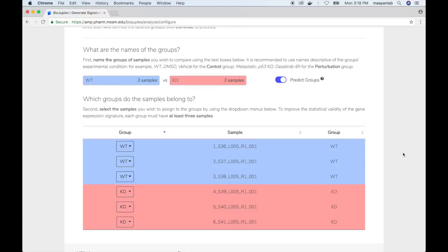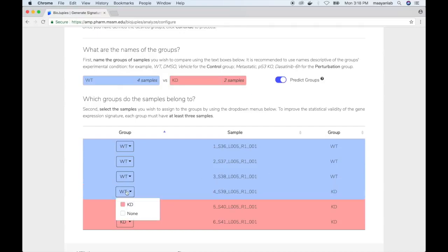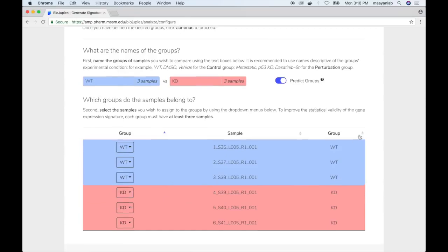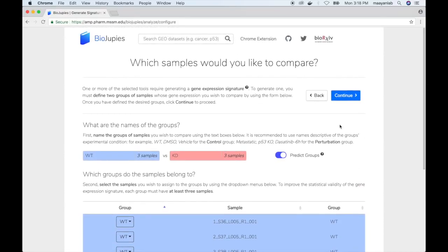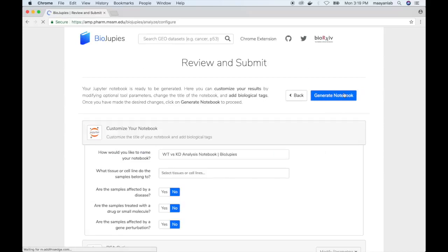BioDrupice automatically predicts the groups based on the names, but the user can also optionally toggle each group using the drop-down menus shown here. Once the desired groups have been selected, the user can then click on continue and proceed to the final step of notebook generation.